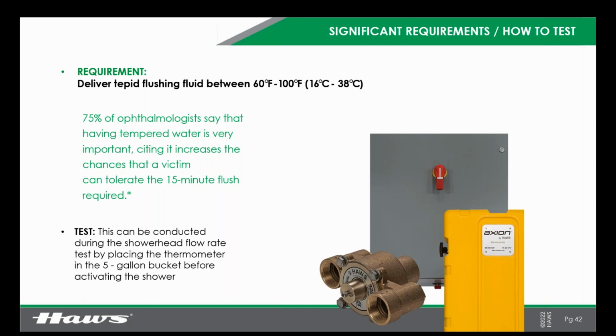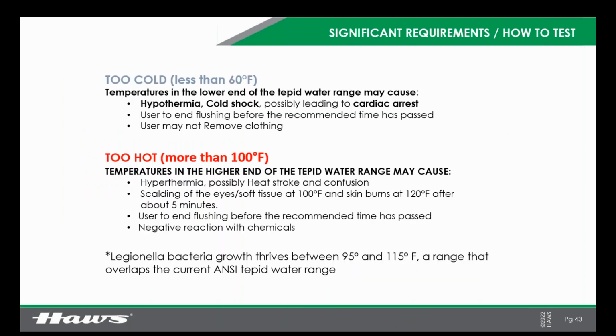Okay, if it's way too hot, it's going to force them out too early. If it's way too cold, it's going to force them out way too early. Okay, it's not going to be comfortable. Nobody wants to sit in 60-ish degree water for 15 minutes, but it's very, very important that they get that full 15 minutes. Okay, first responders show up. They're probably going to ask, okay, how long have they been in the emergency equipment? Has it been 15 minutes? What were they exposed to?